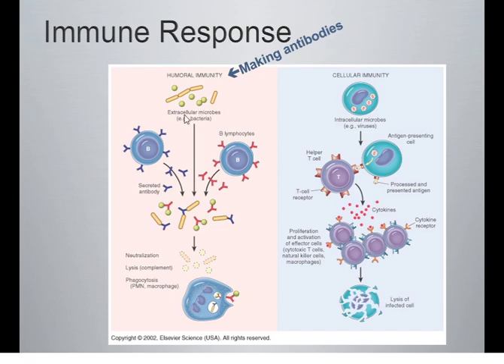The way in which you generate the preliminary reagents for this is you have to take the protein that you want to detect and you put it into an animal, and the animal will actually create an antibody against that protein. And that antibody that they create is used in the ELISA.